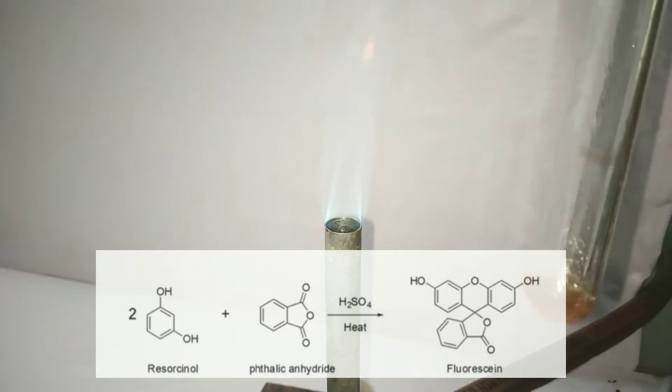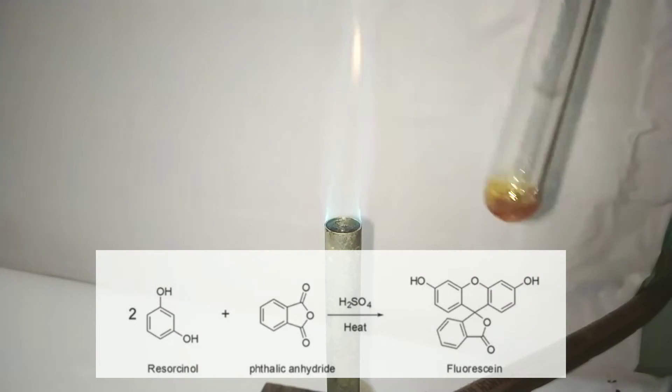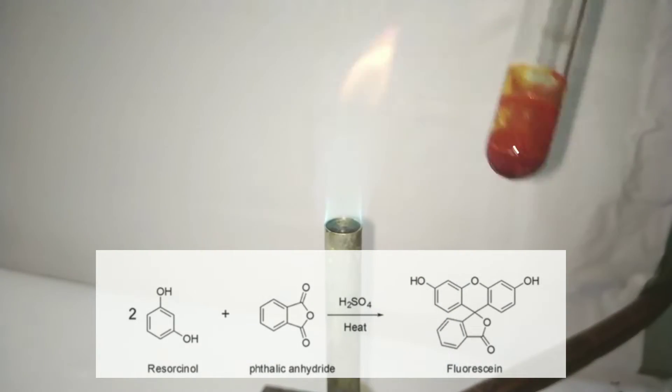Now we gently heat the test tube over the Bunsen burner flame. The compound melts and attains a deep red color. What's happening is phthalic acid gets dehydrated by the sulfuric acid to form phthalic anhydride, which then reacts with resorcinol to form fluorescein.